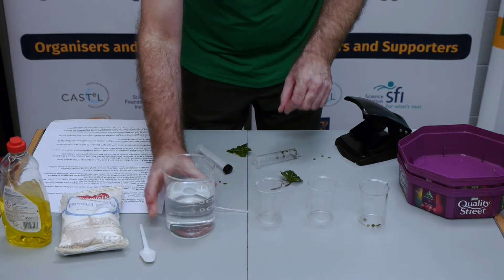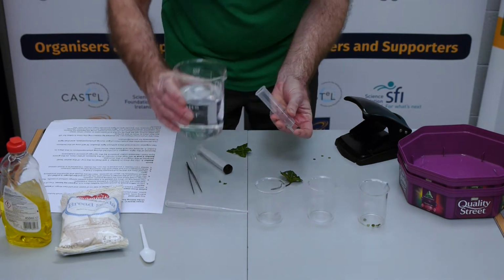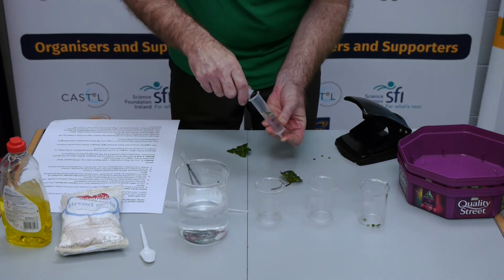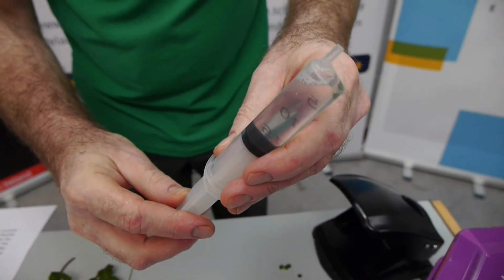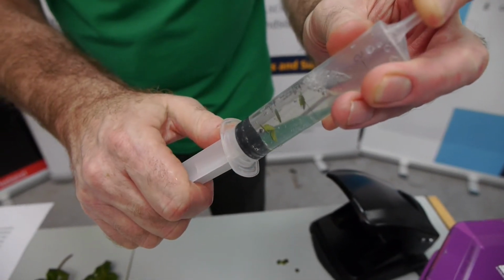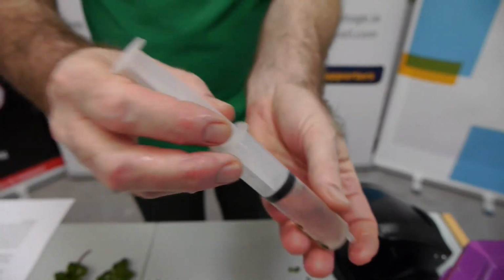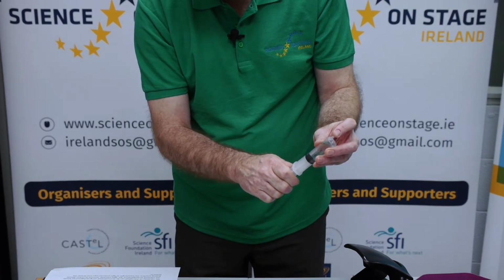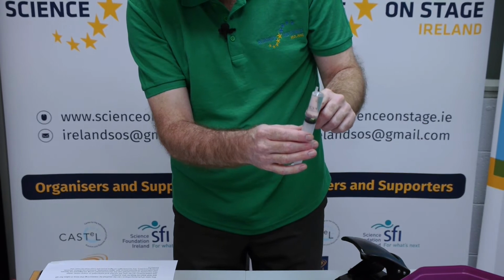So for the ivy leaf discs that I have in our syringe here, I'm going to half fill the syringe with some of this bicarb solution, and put the plunger in, and push the plunger halfway. Then I'm going to put my finger over the end of the syringe, and draw the plunger so that I create negative pressure for the leaf discs. Do this once, you can repeat it again, pull the plunger all the way down. What happens is that the gases in the stomata in the leaf discs are removed, and as you can see, this causes the leaf discs to sink.